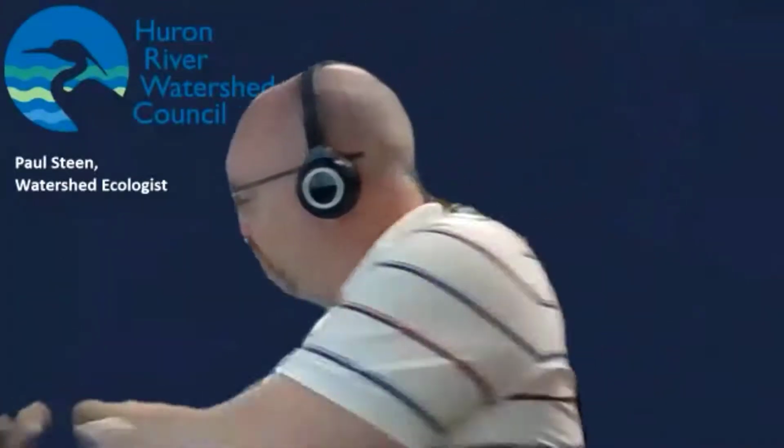Also, when you get your kit, you will get vials that look like this. They're small plastic vials. And that's where your samples will go into after you filter it on the filter paper. We provide nothing special about these, just tweezers. We provide a pin, and you'll see how those are used in the filtering process to help fold your filter.